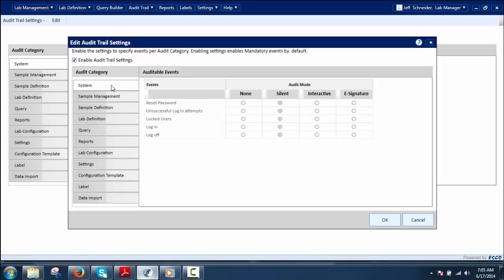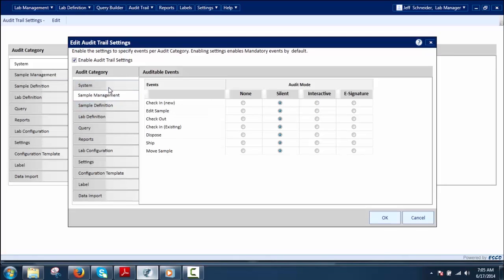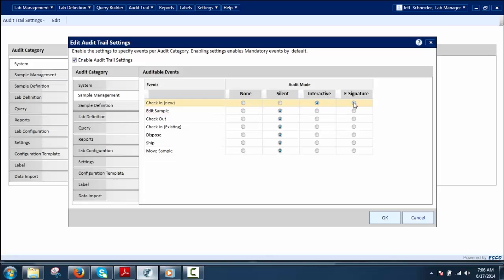For example, in the Audit Category, select the Sample Management option to display the auditable events. Select the radio button for each event to choose the audit mode — either None, Silent, Interactive, or E-Signature. Afterwards, click OK to save the set audit modes for all defined events, or click Cancel to cancel the changes made.